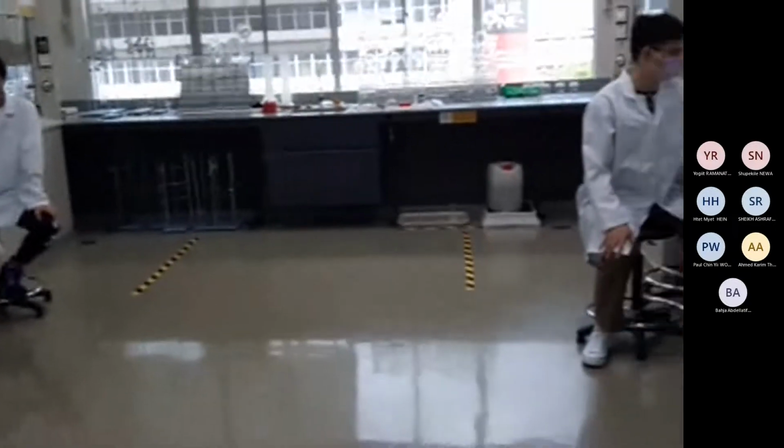That is the only space the light is interacting with the sample. That is called the path. So if you want, you can use this in your report as well. Now you will do exactly as it is given in the module manual, but I just want to tell you about something.